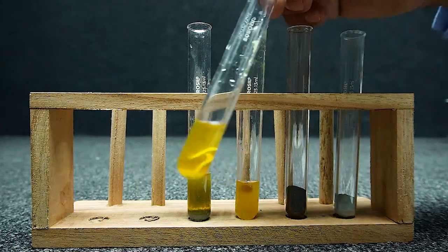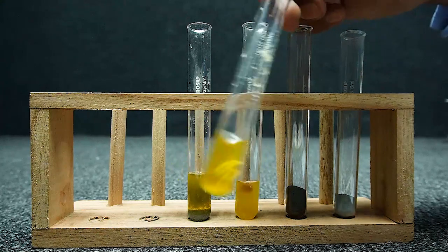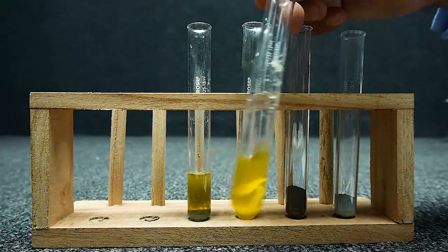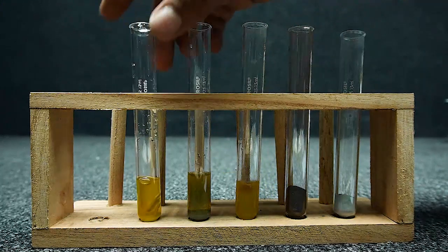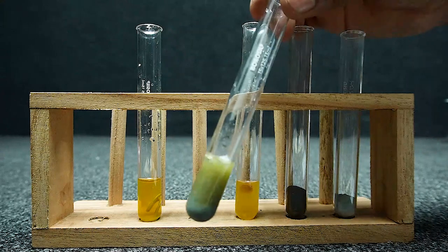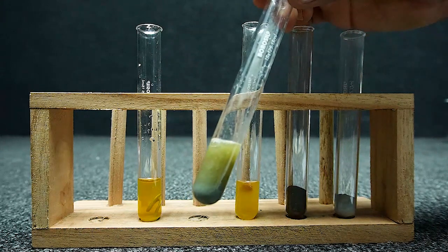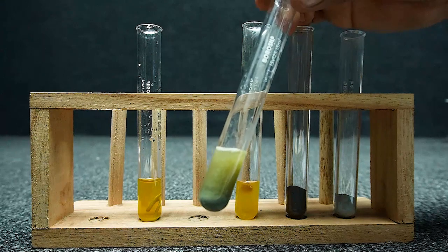The color change of iron sulfate indicates that the aluminium has displaced iron in the iron sulfate. The color change of the iron sulfate indicates that the zinc has displaced iron.